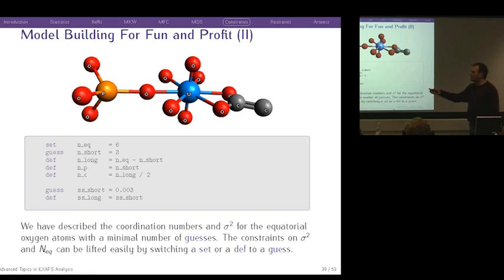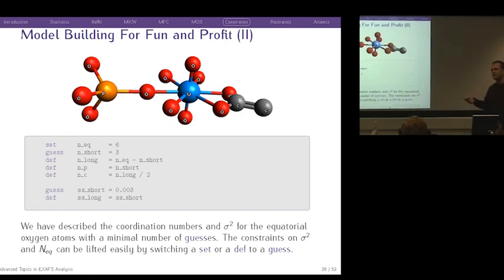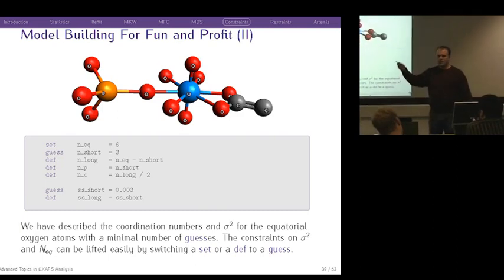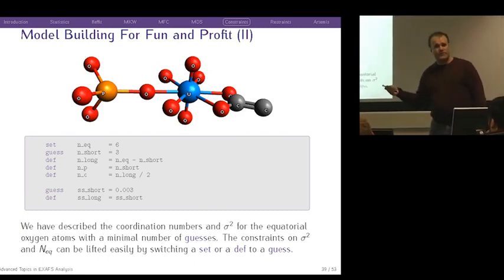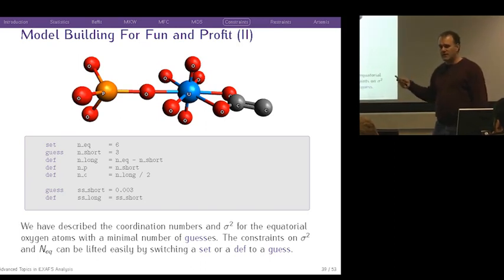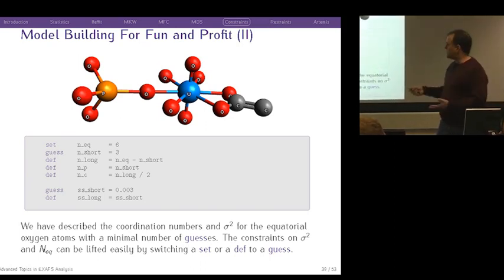So here's a really interesting example of building interesting constraints among parameters. What do I mean by constraints? Well, instead of having independent coordination numbers for all those various oxygen, phosphorus, and carbon scatterers, they're not independent. They're all constrained to be related in this way.